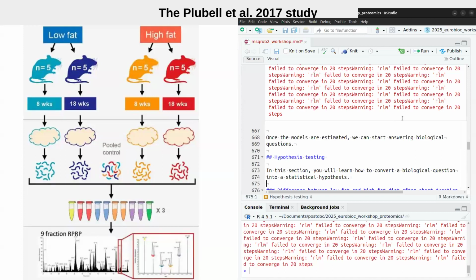Going from ion to protein directly is one way. Another option would be to summarize them first into peptide level information. But we have seen that it's often better to work from the lowest level and summarize immediately. That has been reported.